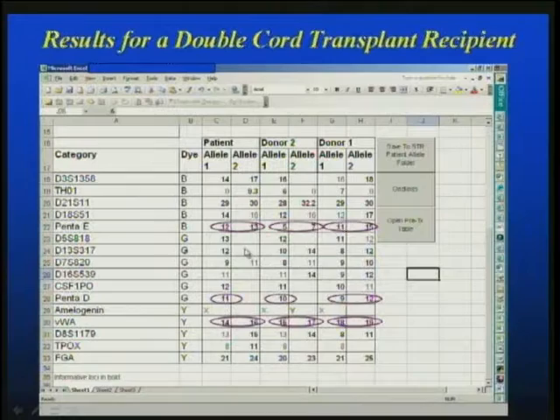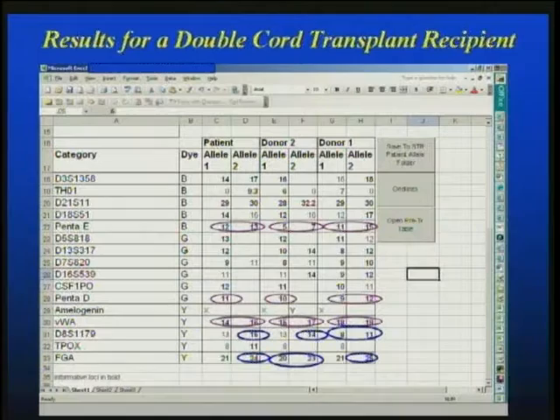But as I said to you, we do not like to restrict ourselves to a minimum number of alleles. We try to extend the number of loci to the maximum number possible. So if we made a few adjustments in our calculations, you can use two additional loci, which are not ideal but can be used. And so using the information from all five loci, we could determine that essentially this individual was a true three-way mix, 30% host, and 35% of each of the cord blood units.